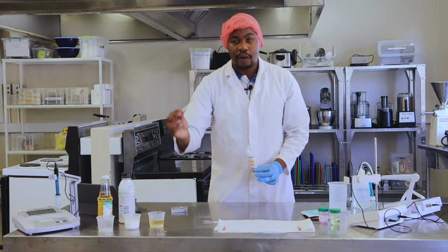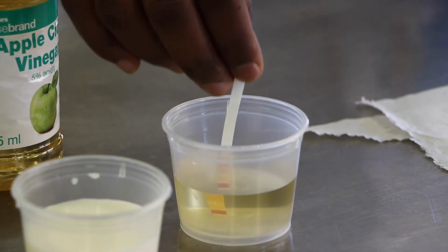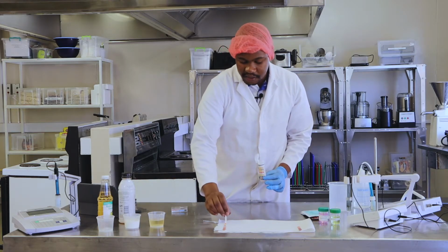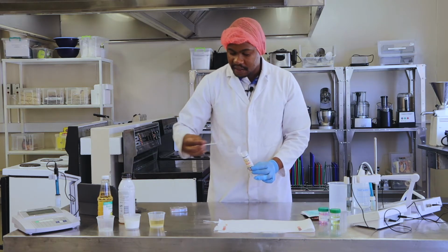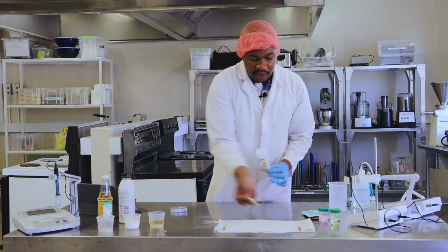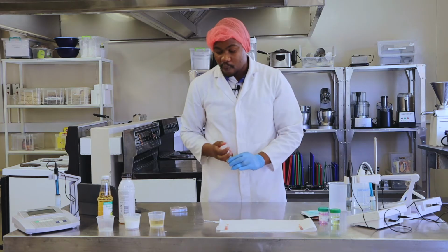If I want to measure the pH of the apple cider vinegar, you just immerse it for a few minutes. This is my apple cider vinegar here. In the other case, let's say I want to use the milk. Here I want to find out what the pH of milk is. Why?